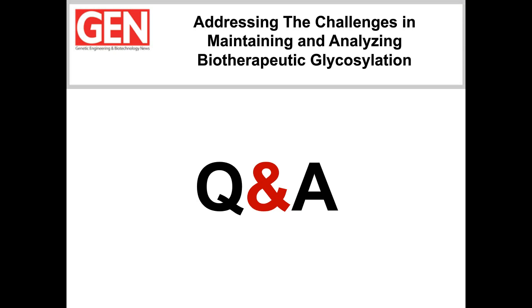And Eric, someone says they noticed that the AXR-1 may be more highly resolved. However, it appears that the neutral glycans are not noted. Are they bound on the AXR-1 column? Yeah, they are. So this AXR-1 actually addresses both neutral and negatively charged glycans, and so the neutral come out earlier in the retention time. And in some of the application notes, you actually will see that in the data shown. I think in this slide we didn't have that in that time frame, but it does come out earlier. They do retain on that.